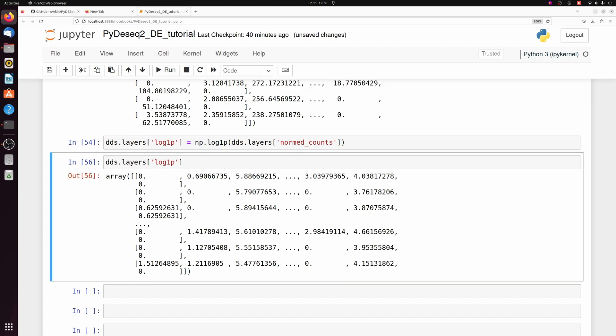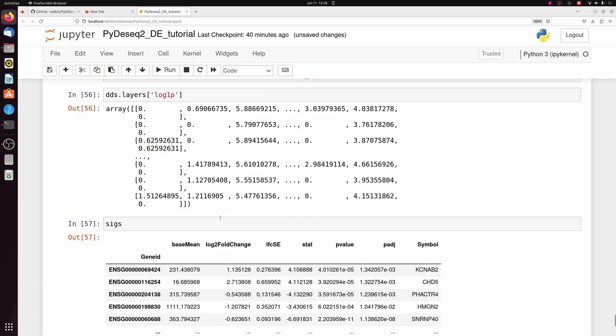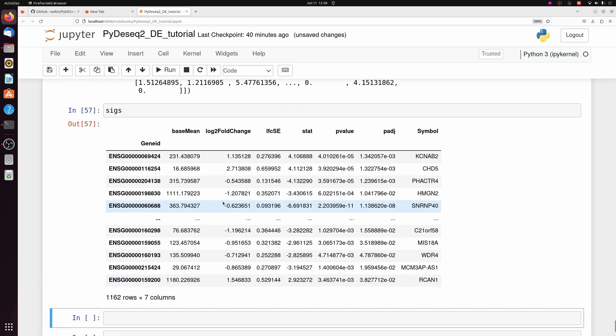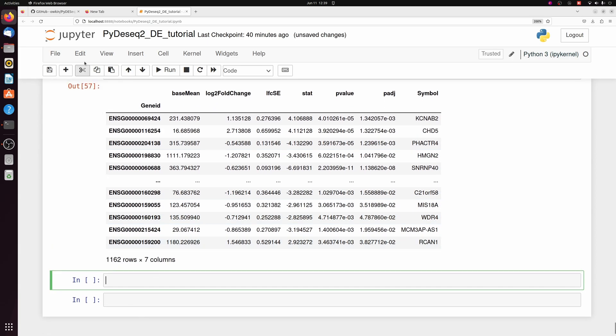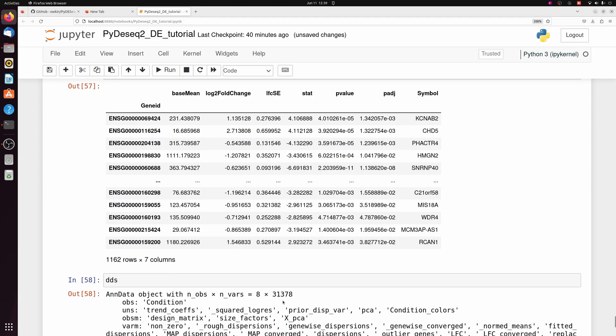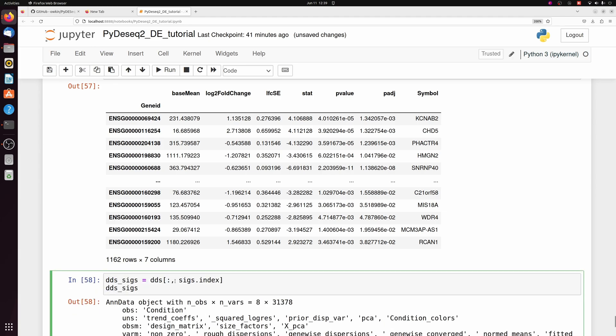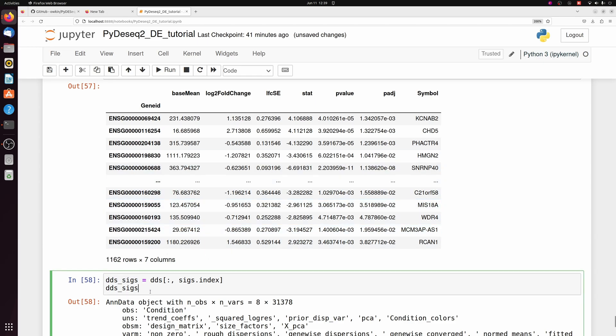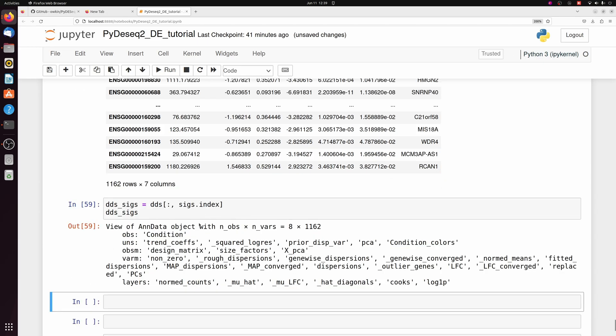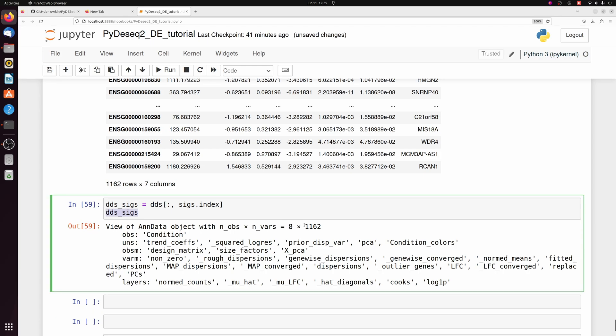And of course, you can pick whatever genes you want for the heat map. There's not like a rule. I'll just show with the significant genes. As a toy example, this isn't really going to show much because there's a thousand genes and there's not really any point to this heat map, but I'm just showing it as an example. So I'm actually going to make a subset of the DDS object. So DDS has all 31,000 genes, but we can subset DDS with sigs.index, which is just the gene IDs here. So we're passing these 1100 gene IDs to filter DDS on. So if we look at DDS sigs, which we just made, there's only 1100 genes in this DDS object.